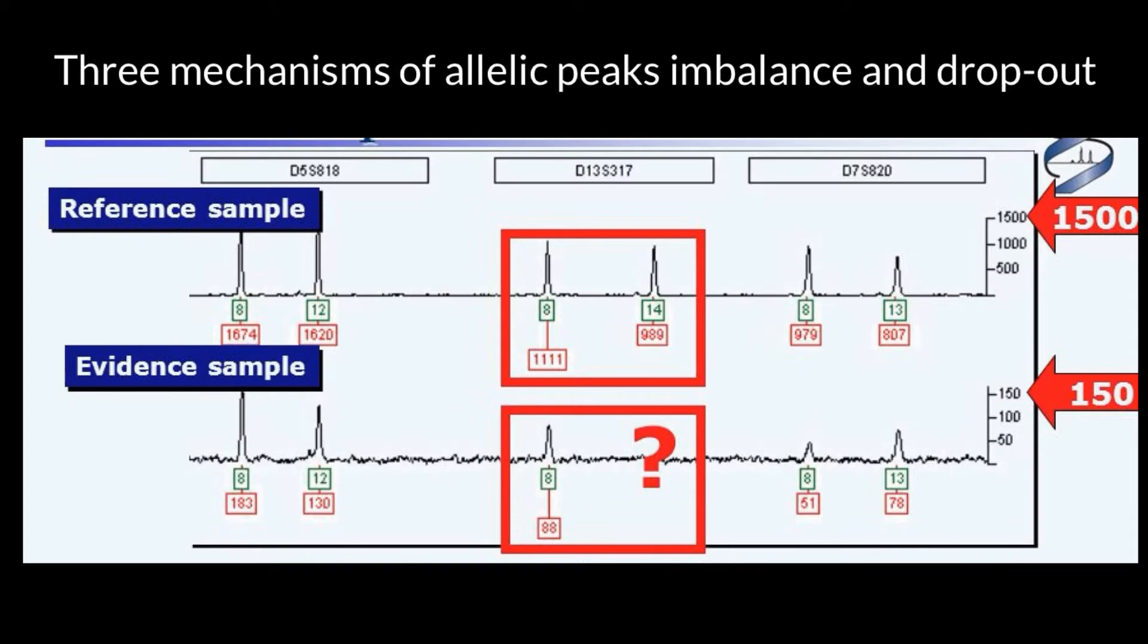So today we are going to compare these two electropherograms. And on the first glance it looks like for one locus these two samples have the same number of repeats in alleles. So 8 and 12 here, 8 and 12 here.